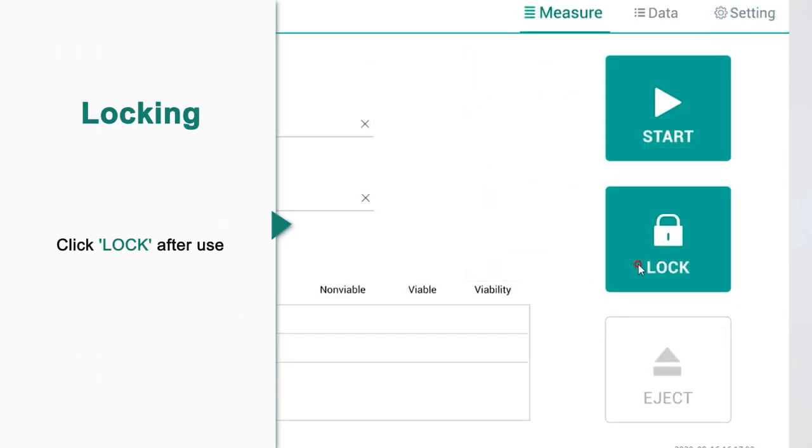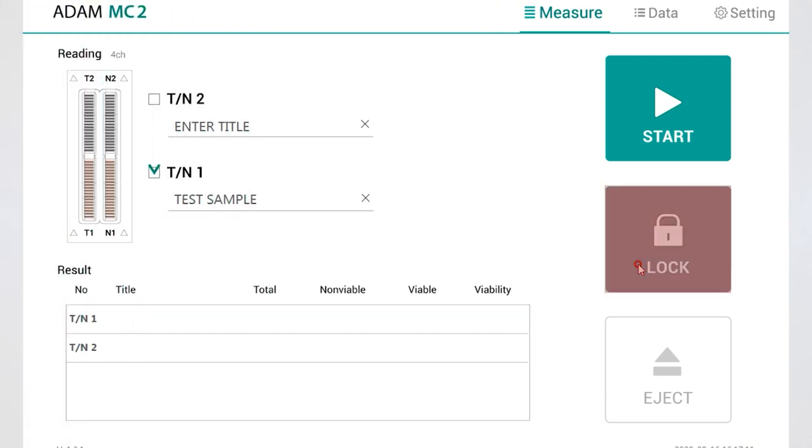Lastly, locking. When you turn off the Adam MC2, click the lock button on the measure tab.